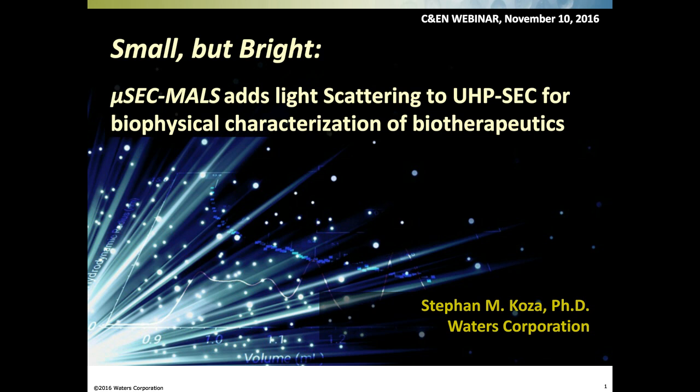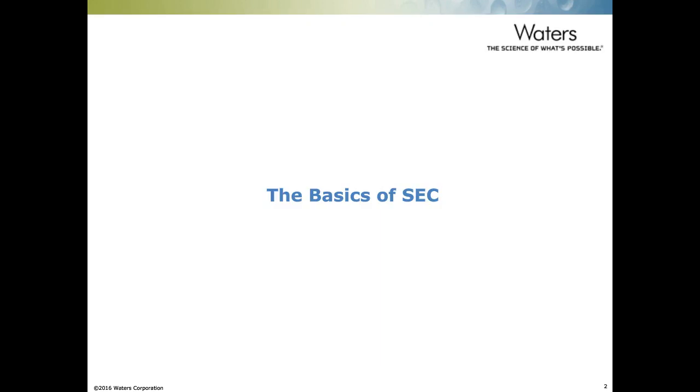Thank you, and thank you for joining our webinar. I'm going to start this webinar off by talking about the basics of SEC and where small particle technology plays a role in SEC separations.